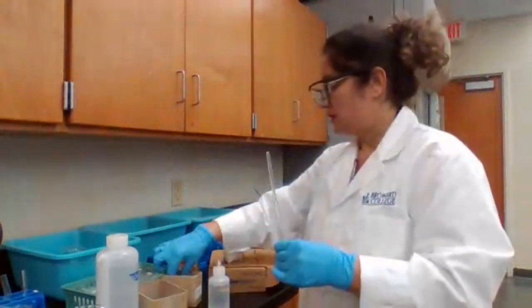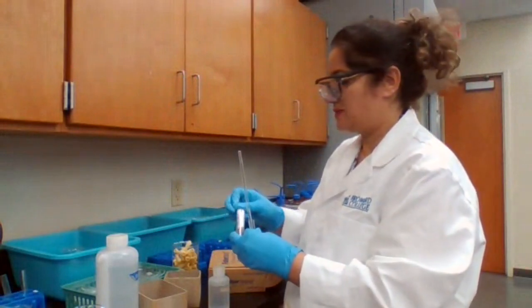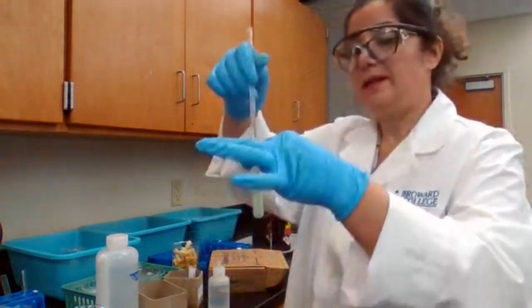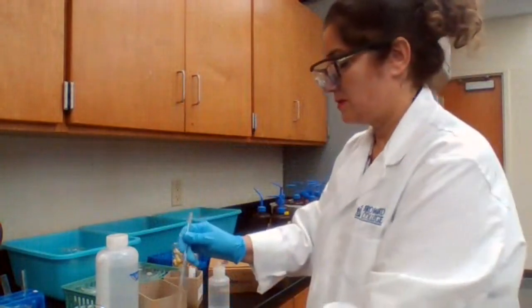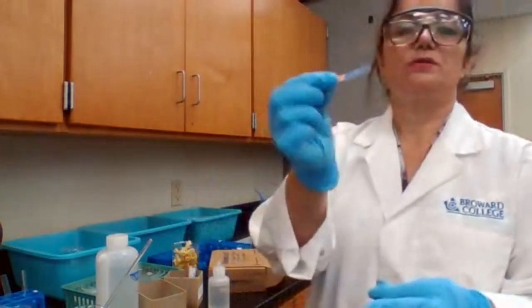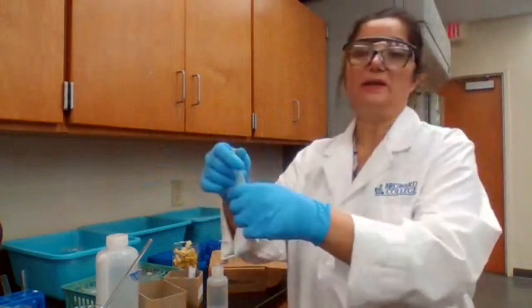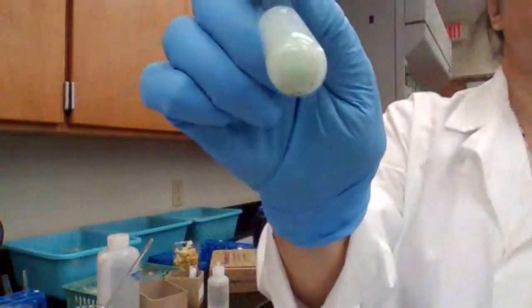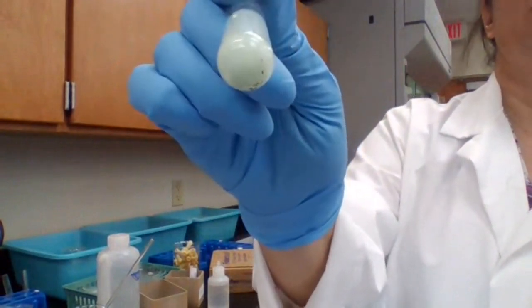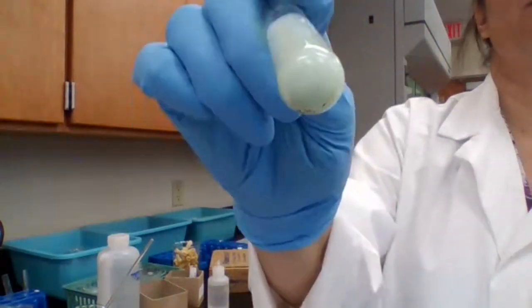But to make sure the solution is basic, it is expected to be basic, because 6 molar NaOH is a very strong base. Place it in a watch glass and add 1 drop of the solution. The solution is basic, so I could see it already. I hope that you can see it. You see those black particles in there? Those black particles are bismuth. So if you have the black particles, that means bismuth is present.